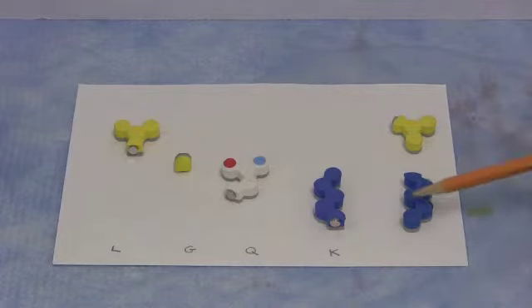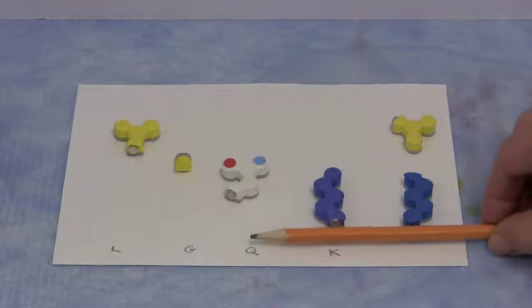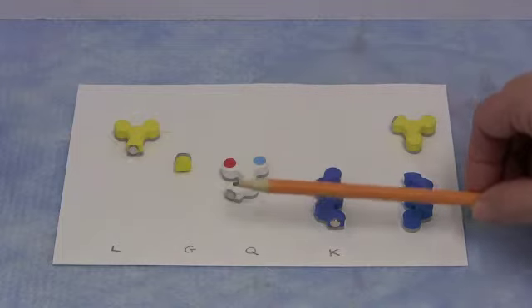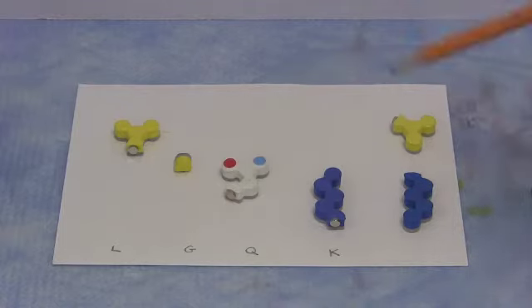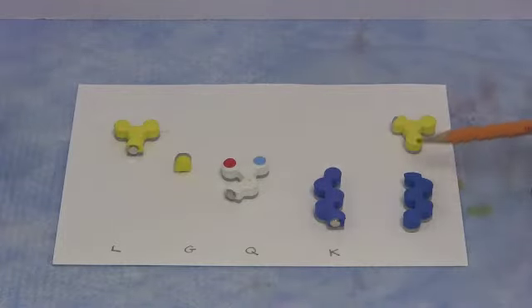And of course what you can do then is measure the distance of all of these spots. That's the RF value, and the RF value is given by the distance traveled by the spot over the distance traveled by the solvent front. That's why it's important to mark the solvent front. And you'll be able to compare RF values for these knowns and, by comparing those with the RF values for the 2 spots in your unknown, you're going to be able to get the identity of the amino acids in your unknown.